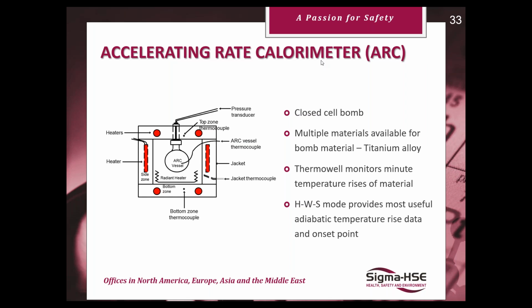We typically use the titanium alloy, but there are different materials out there: Hastelloy C, stainless steel. There are also glass bombs, but they aren't able to withstand anything like the pressure increases that the alloy ones are.